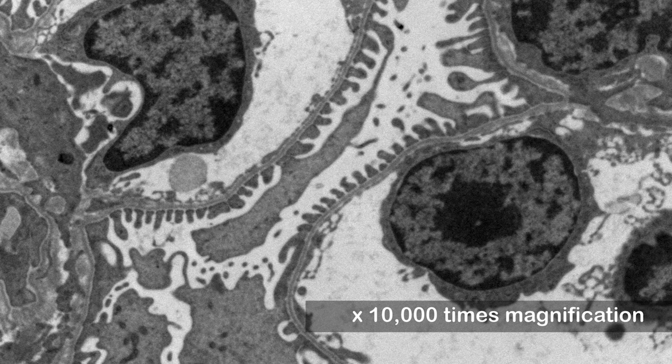At 25,000 times magnification, cytoplasmic details and membranes can be seen.